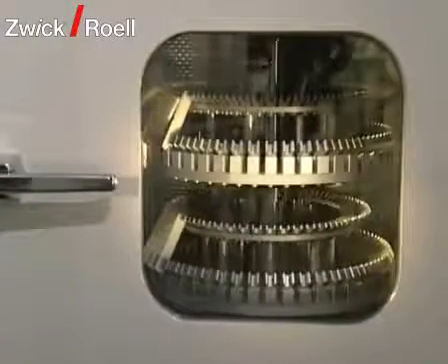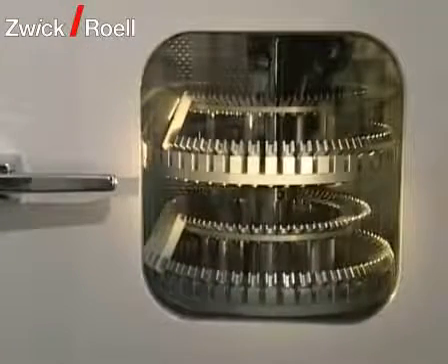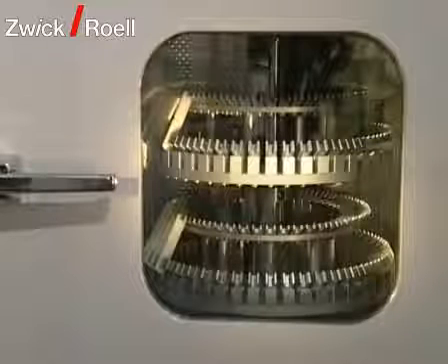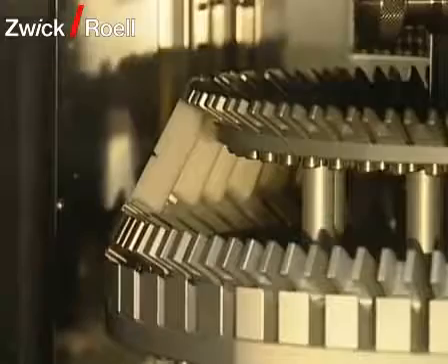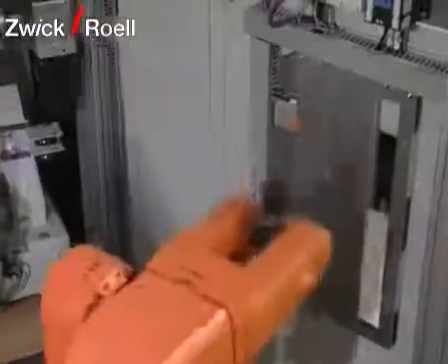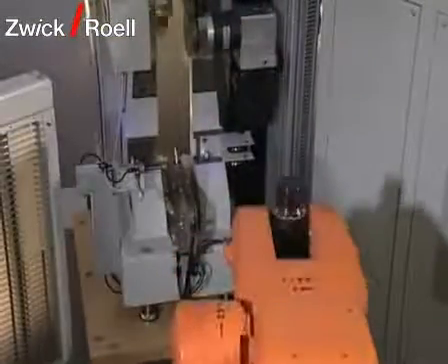Specimens can be cooled down to minus 60 degrees Celsius with the integrated temperature chamber. Because of the quick transportation of the specimens with the polar robot, the specimens are tested according to the standards within a maximum of five seconds after removing them from the chamber.